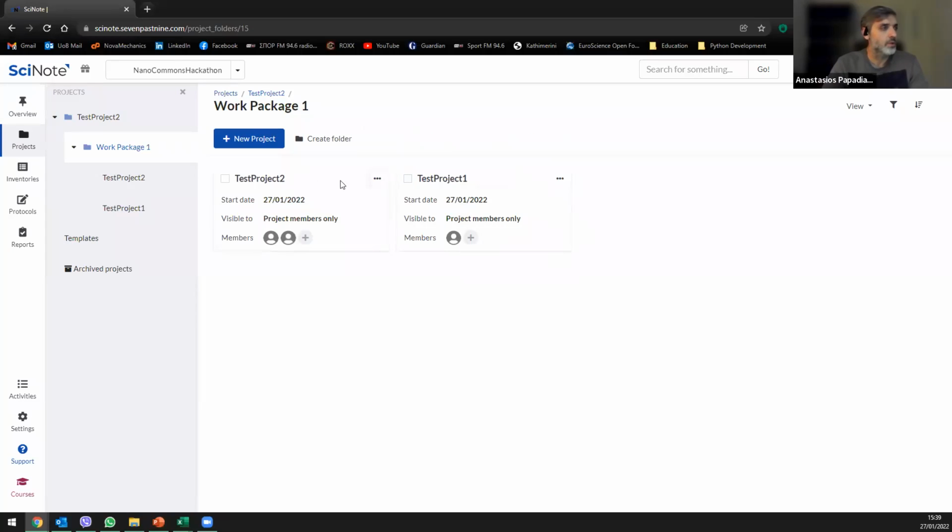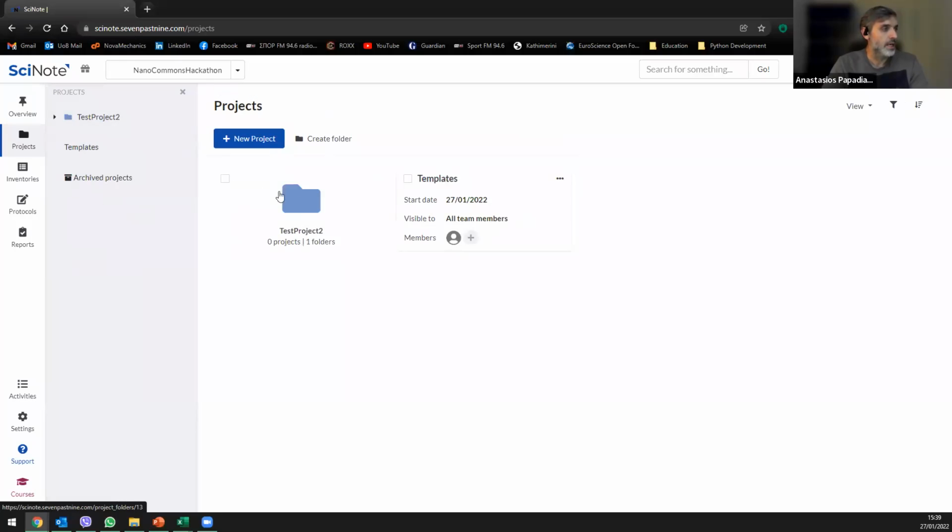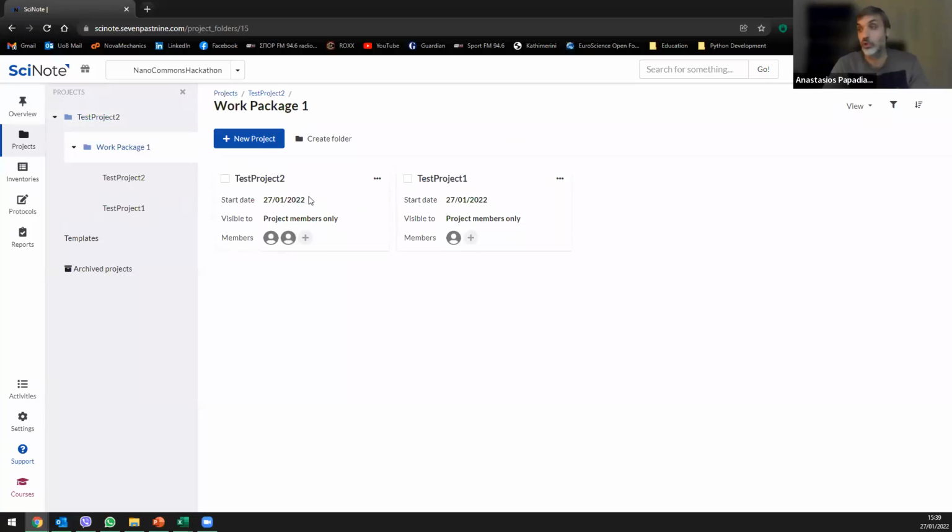So again, if you click here, okay, I'll come into this in a second. I think with projects you probably cannot copy them, but we'll see now that you can actually copy the tasks and the workflows that you create within projects. So the idea is that you create different projects and then use the workflow that you have already established to move between projects, although this will have some caveats.